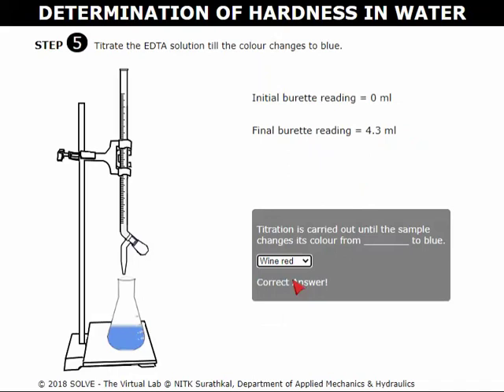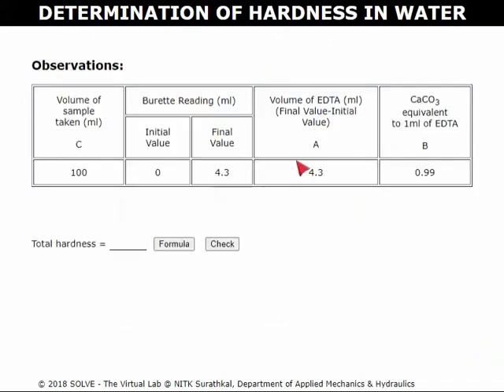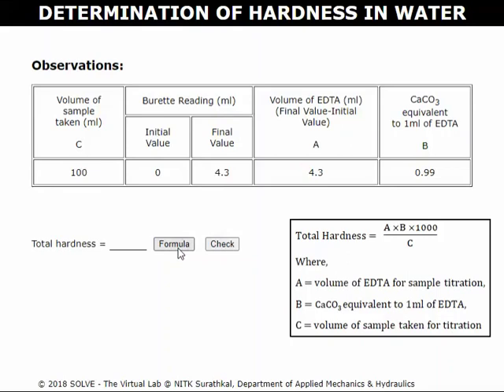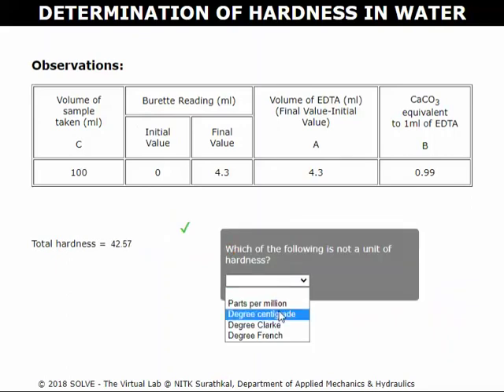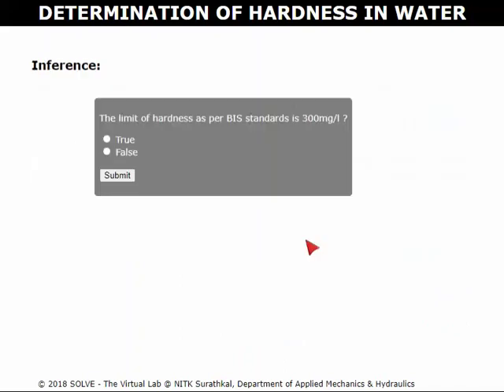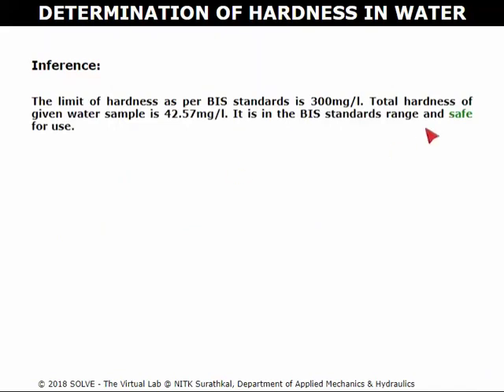These are the observations of the current trial. Click here to know the formula used to calculate total hardness. Click here to enter the calculated value. Click on check to check the actual value. Select the correct answer for this pop-up question to proceed to the next step. Select the correct answer to proceed to the inference. This is the inference drawn for this current experiment conducted.